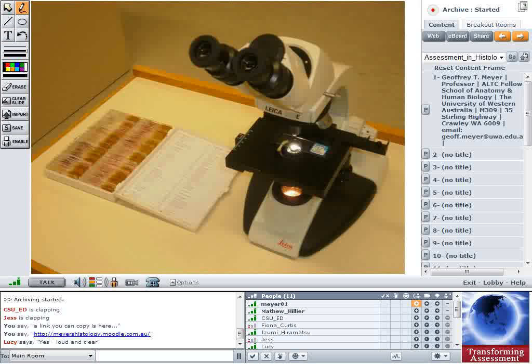The other problem is, when you teach histology traditionally, in what I call the old way, students don't actually have all the slides in their slide box that depict all the characteristics of organs. We have some very special slides that we only put out each week, depending on the topic, that are demonstration slides. And they will never see those slides again, particularly as they get towards the exam time, because it just takes too much effort to reset them up for demonstrations at the back of the class. It's too labour intensive. So that's how the exam was originally provided.